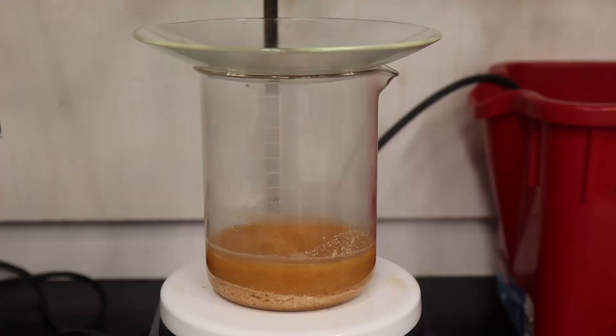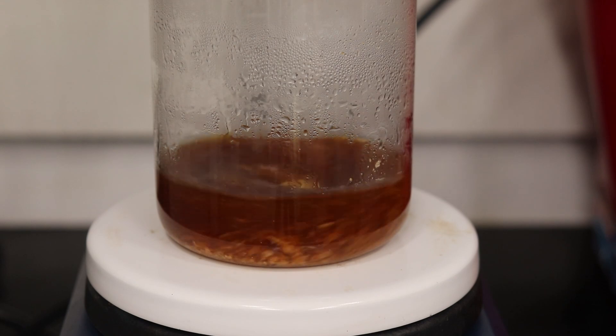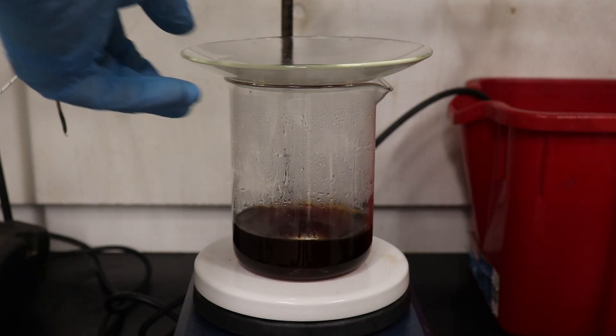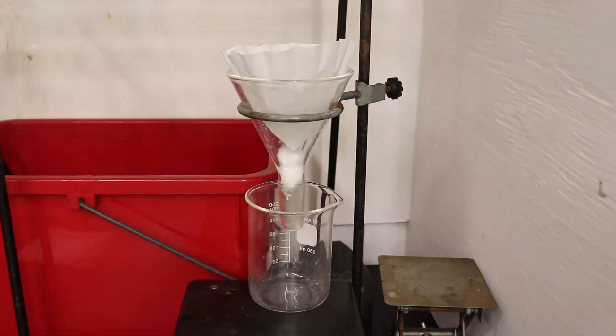I ran the recrystallization using a minimal amount of boiling ethanol, and I tried to use activated charcoal to decolorize the 2-methoxynaphthalene. However, it didn't seem to have much effect on the overall coloration of the solution.